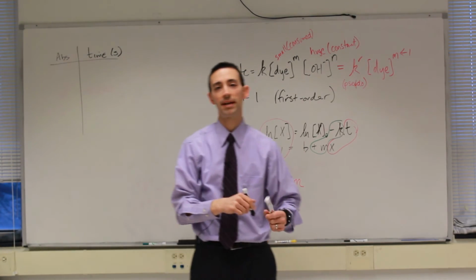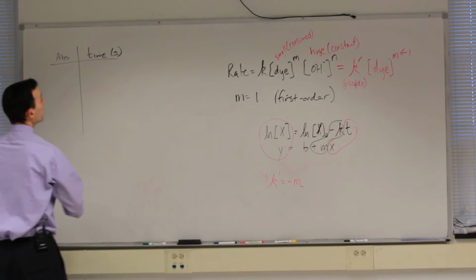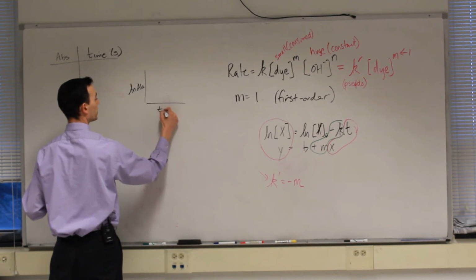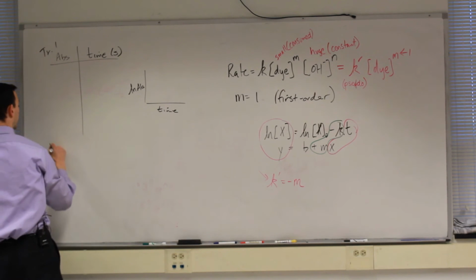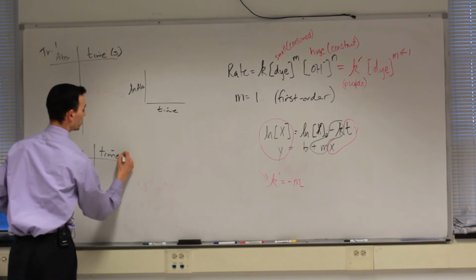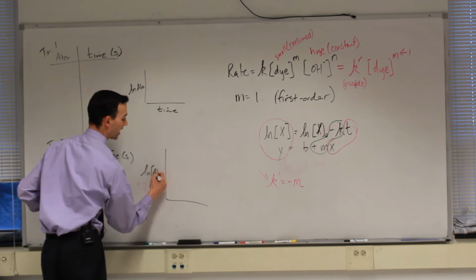If you gather it in minutes, you'll want to convert it to seconds for your graph. To make your graph, though, you're going to plot the ln of the absorbance values versus time. And you'll do this for 2 trials. So you should have data that's set up pretty similarly for your 2 trials so that you get 2 graphs.